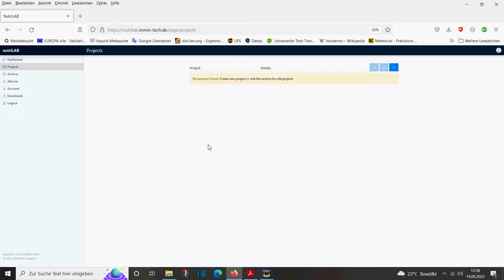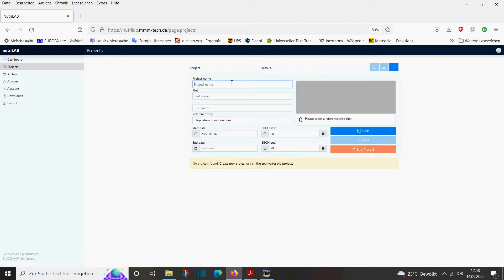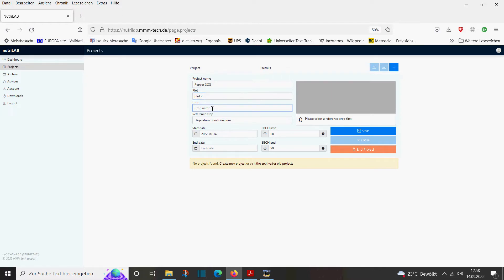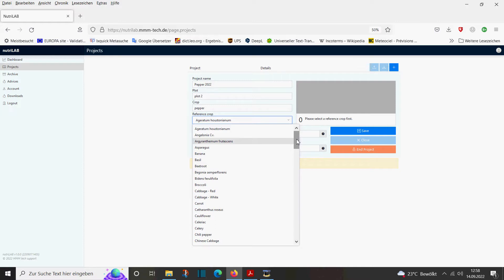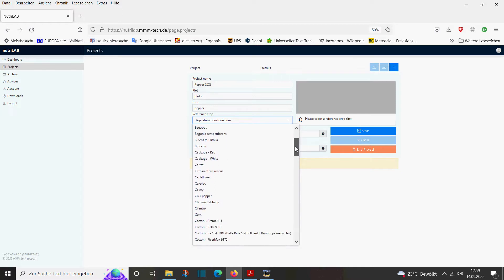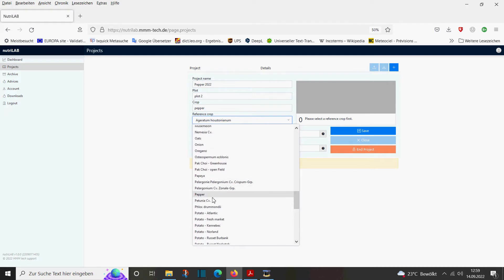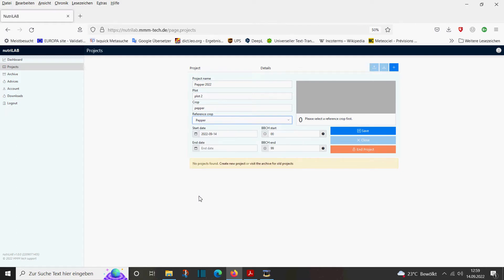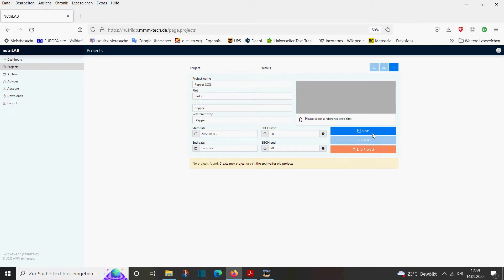Let's start by creating a new project. We will use the demo crop pepper. The plot name is plot number two, the crop is pepper of course. Then we have to choose the reference crop — since we have pepper in the database, we use pepper in this case. We define a start date of May 3rd of this year and save it.